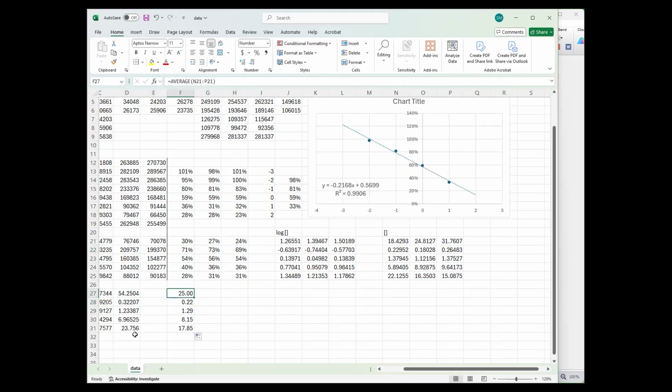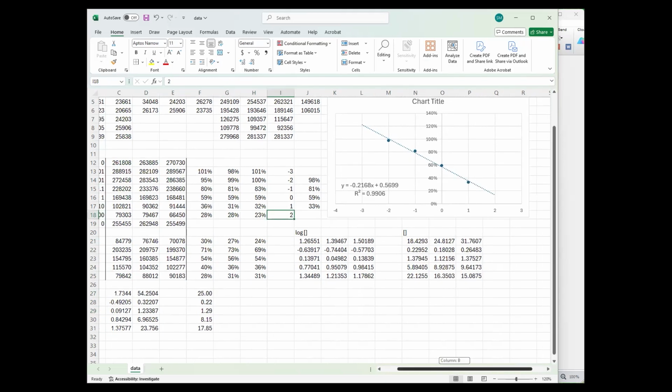That's a lot further off. It still works because we're close here. Let's see, the log value is about 1.4 or so on average. This one's about 1.3, 1.2, so it's close to 1. 1 is a point in our standard curve, but because we're getting outside of that, you start to get some decrease in accuracy there. So I would recommend, again, putting points in there, or diluting your sample so it just stays within the linear range of the curve. But these are 2 different ways you can do it.